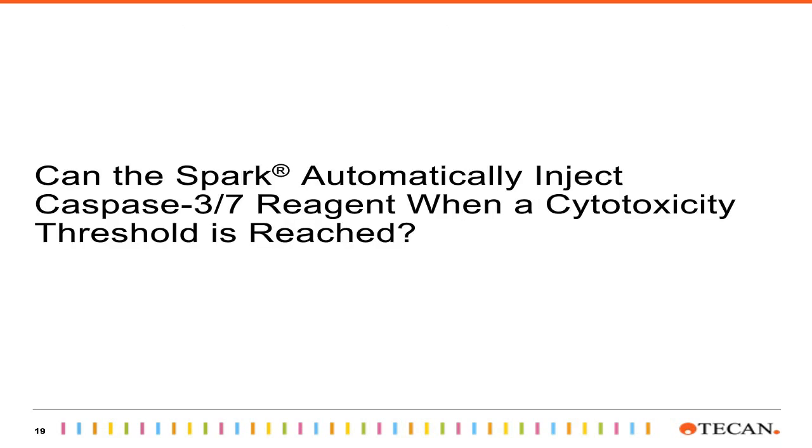So for our second round of experiments, we were interested in knowing whether or not we could use this change in cytotoxicity, or this cytotoxicity threshold for apoptosis detection, as a setting within the Spark software that would be used as a condition for automated injection of our caspase 3-7 reagent. So just as a little recap, in our previous experiment, we were the ones dictating when the caspase reagent was added to the plate. And again, this is a little bit more of a traditional way of doing a time course experiment with those lytic reagents. But now for this next experiment, we wanted to see if the data would dictate when the caspase reagent was added to our assay plate.